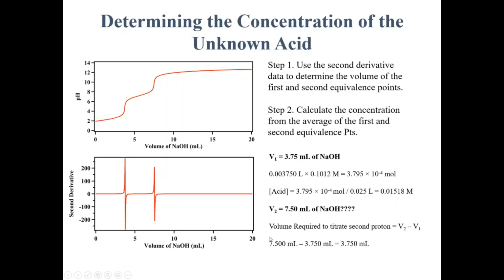Now, my data was simulated. I wrote a quick script to simulate the data, and it's perfect because it's simulated. In the experimental case, you might get slight variations. You might get a slight variation from the first volume to the second volume when you do the subtraction. It'll be small, but it may be there.